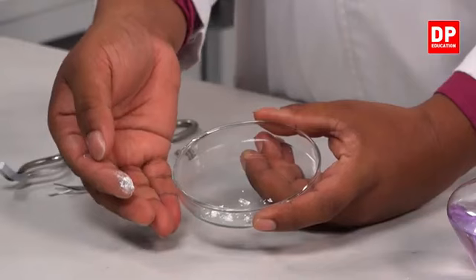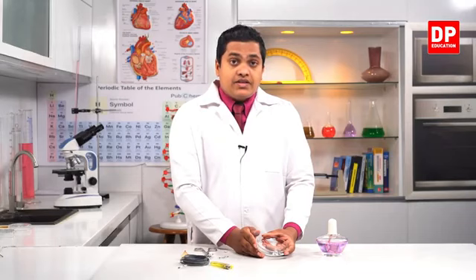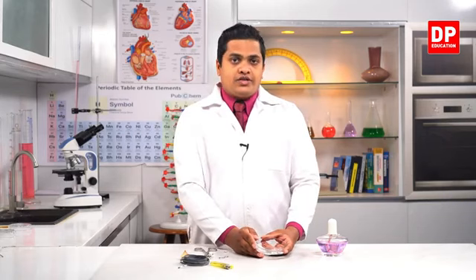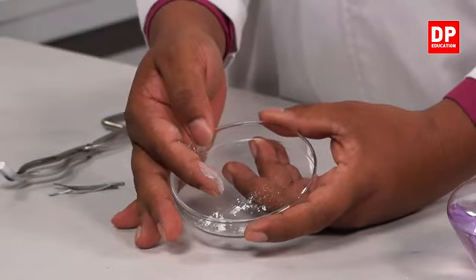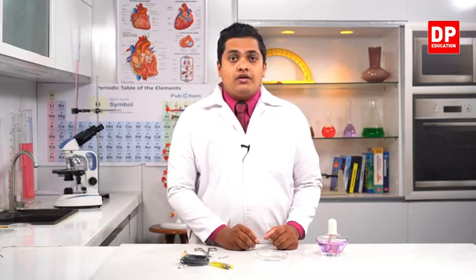Now here also you can see a white color powder. So burning a piece of magnesium is a good example for a chemical change, right? These chemical changes are also referred to as chemical reactions. Here the magnesium has reacted with oxygen gas to produce this white color magnesium oxide powder. So burning a piece of magnesium is a good example for a chemical change, or a chemical reaction.